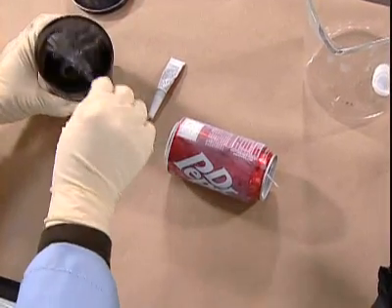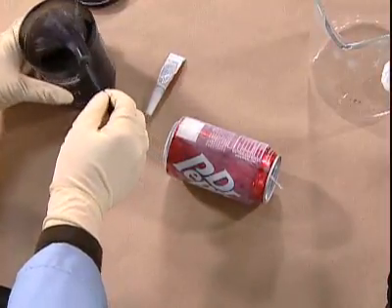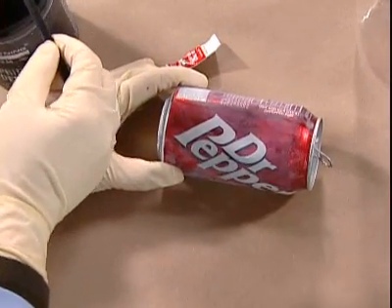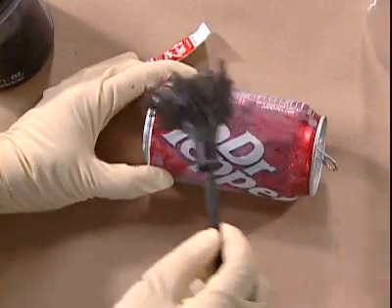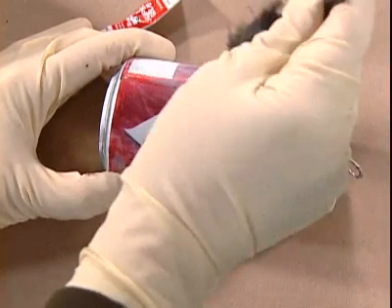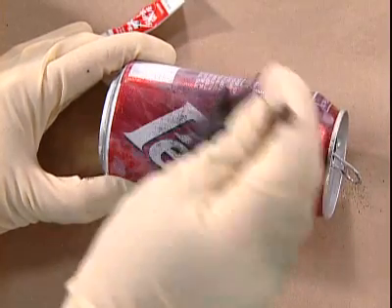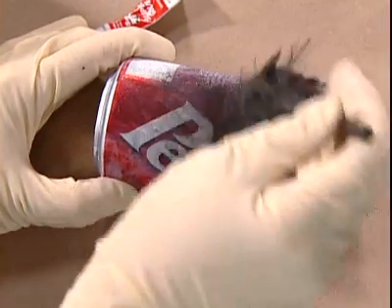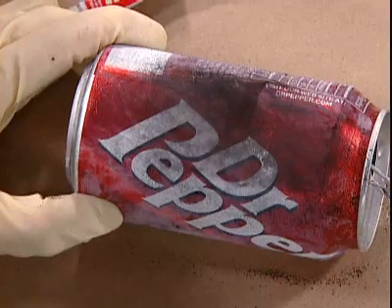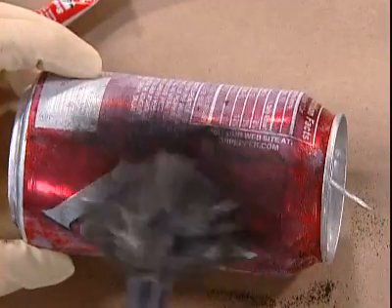So I've dipped the brush in here and just tapped off any excess. And now you can use your own creativity, and you can use what I like to call the paintbrush method. Put it on like this, or there's always something called the twirling method where you take the brush and you spin it. So let's try the combination, twirling and brushing. Now I've got the powder on there. Let's see if we can get some of the excess knocked off of here.